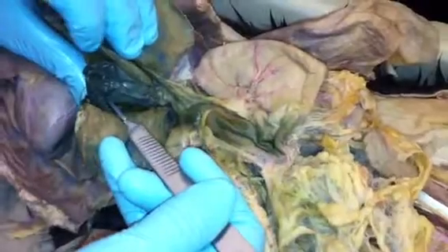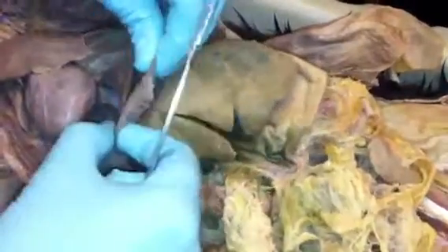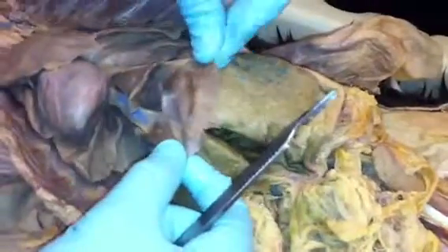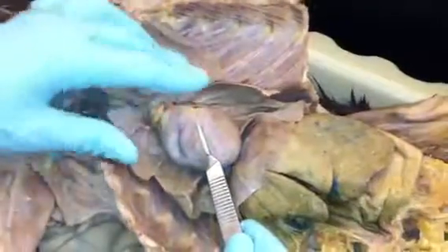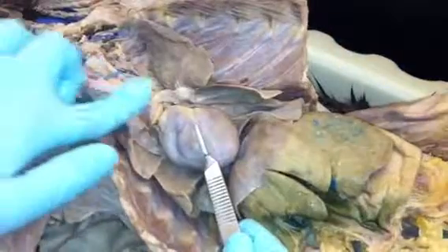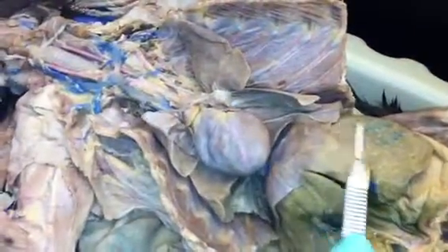We have the liver. Liver here, underneath it is the gallbladder. Above it, which separates the abdominal cavity from the thoracic cavity, we have the diaphragm. Up here we have the lungs on each side. In the middle we have the heart. There we removed the thymus that was overlying on top of the heart. And that's about it.